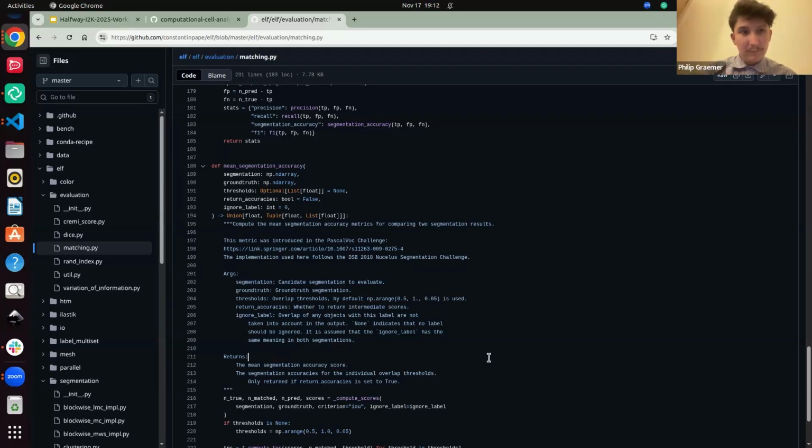In a nutshell, it's a very hard metric because you are considering IOU 95 as a criterion for your mean, which is, let's say, a bit rude to your segmentation method, but it is also fair to consider hard criteria as high as 95% of an overlap, for example. This is what we do. We present all numbers in Microsam 1 on this. In our lab, in all papers that we are a part of, we follow this track for instance segmentation. For semantic segmentation, it's the dice score, the obvious thing, checking classic overlap.